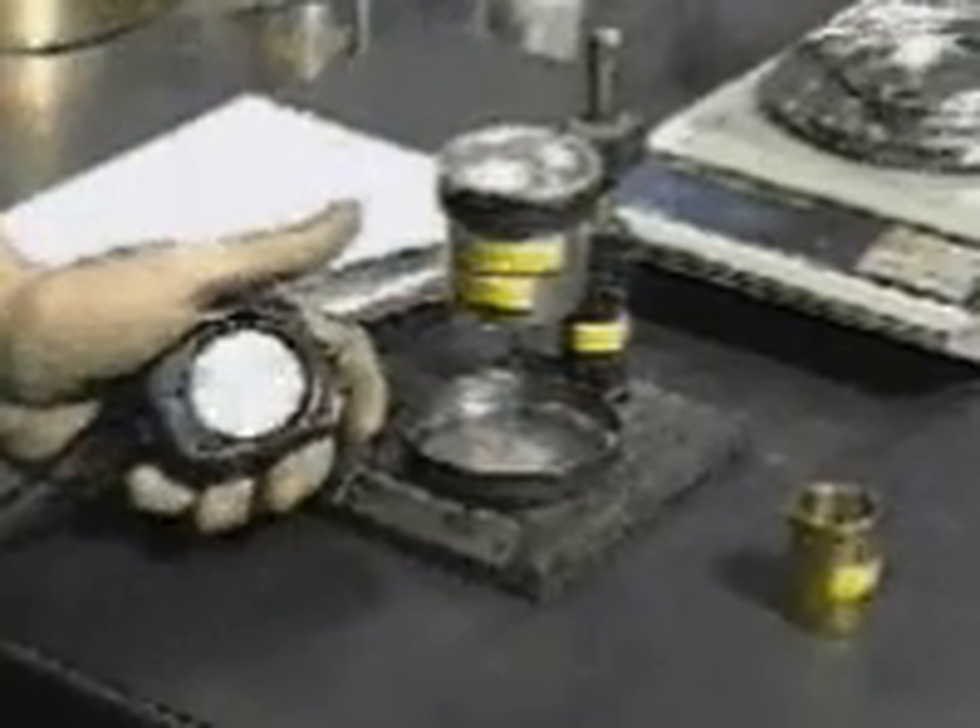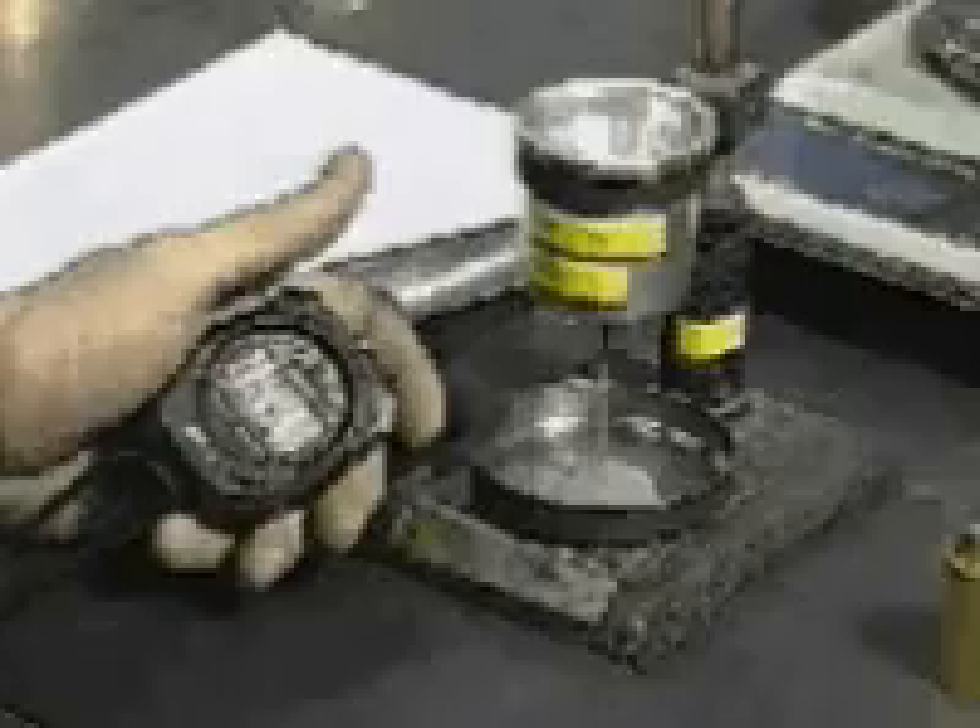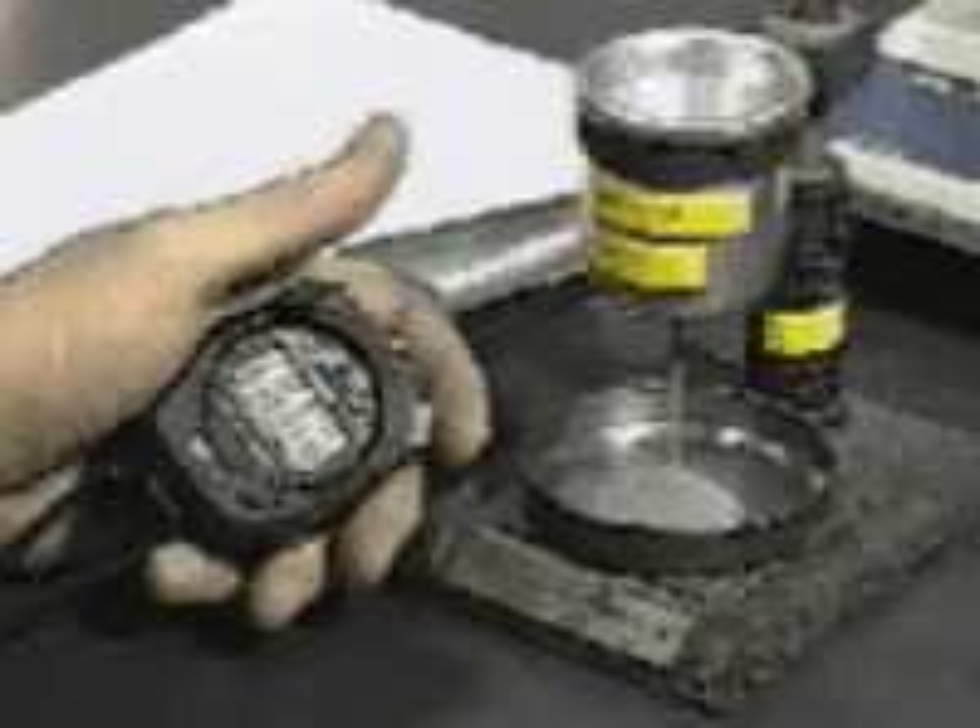The stopwatch shall be started simultaneously with the removal of the finger from the discharge orifice and stopped at the instant the last of the powder leaves the funnel.